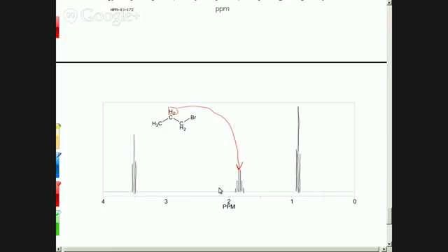But when you go to the peak all on the left, you need one where the adjacent is 2. Right. So each of these has 2 adjacent, and this one has 2 adjacent. So which one do you think is which? Isn't the higher one CH3? The one with the higher peak is going to be CH3, so yes. How else can we know that? If we didn't have that, the deshielding, the electron pull. How is that going to present itself here?